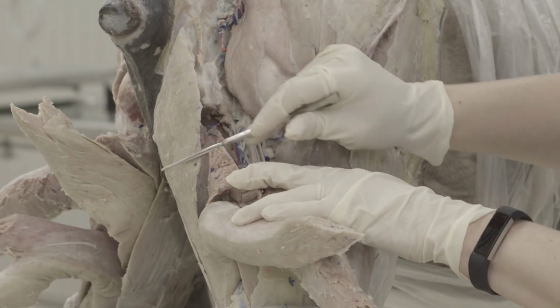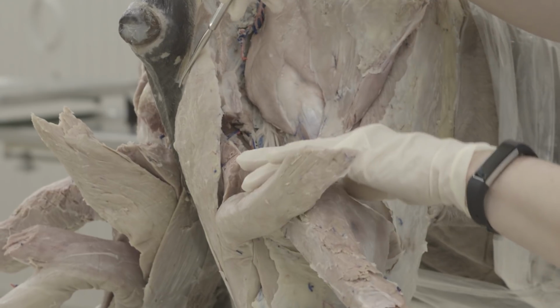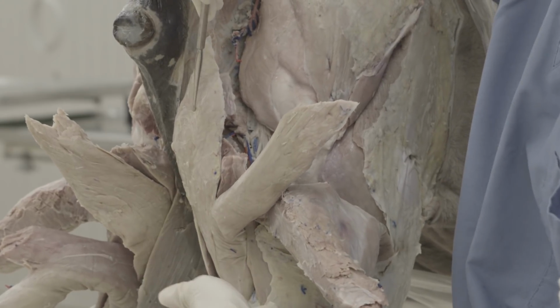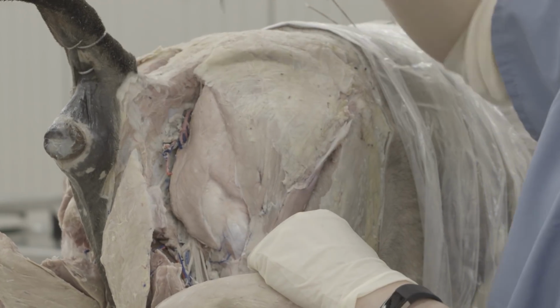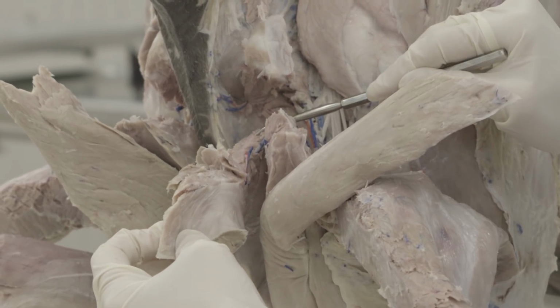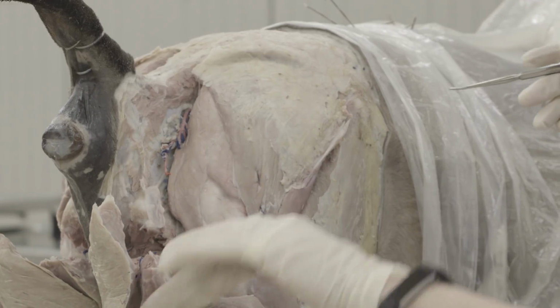Then we have semimembranosus here. So semimembranosus muscle, and you want to define in between semimembranosus and that gracilis muscle on the medial side there. So just make sure you're not cutting gracilis, and then you can cut this proximally, the semimembranosus. Cut that proximally and reflect distally. Again, you have these two pieces, so make sure you're cutting through both of them. All right, and then we'll move on to the gluteals.